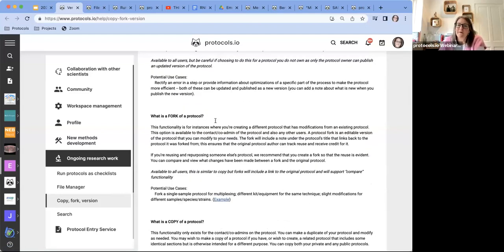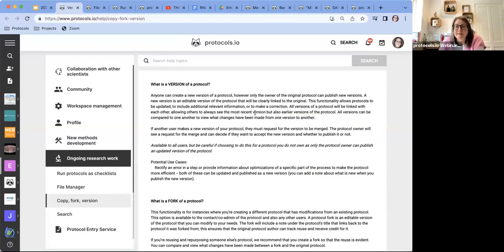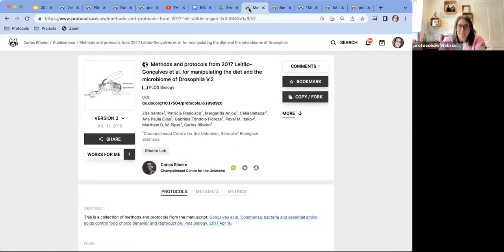So the fork, though, let me give a few really nice examples of how that's actually been used. Oh, that's collections. We'll come to that later. Let me move that to the end.